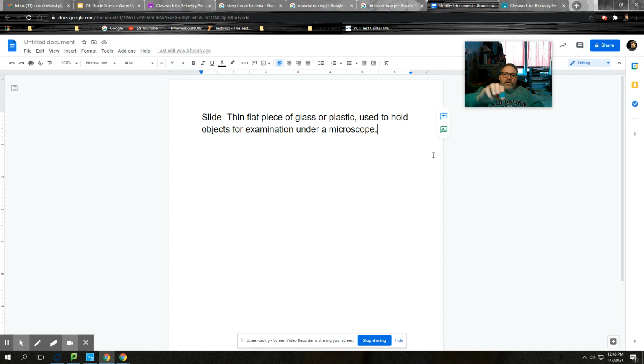Okay, we've already talked about it. This is a microscope slide. Let me see if I can hold it against my shirt so that you can see it a little bit better. All right, this is a microscope slide, and this one is made out of glass. If you look, maybe you can't see it, it's got a chip in it. You can see that it's broken right there.